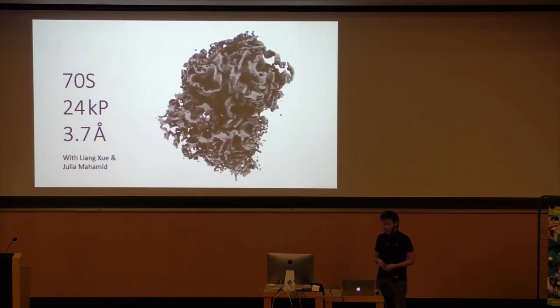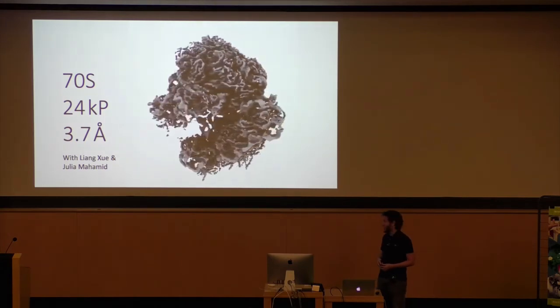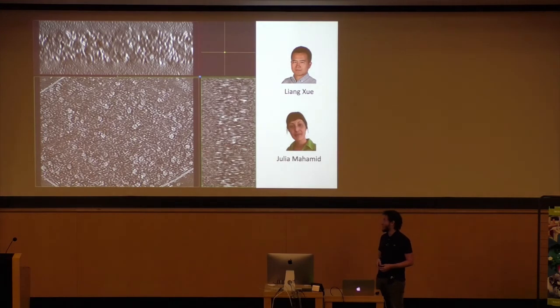So the reason I'm excited about this is because this is what the raw data look like. It's actual in situ. We imaged those ribosomes directly inside bacterial cells, unperturbed, except maybe for the outer surface of the bacteria. So this thing has everything in it that life needs to live.